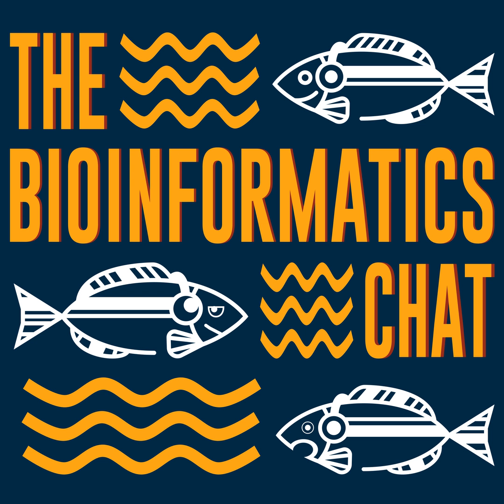And this approach was very popular. Historically, I think, it used to be the first approach that was proposed, I think in the early 90s, maybe even before. And it was also popularized by Gene Myers, who used to be a researcher at Celera Genomics. And this approach was first applied to Sanger sequencing reads that were roughly 1,000 base pairs in length. And for comparison, a simple bacterial genome is several million base pairs. So your reads are basically 100,000 times shorter than your genome.